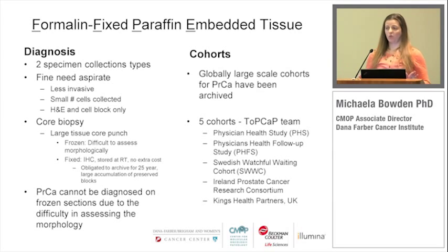making that the gold standard. So the gold standard's fixed tissue, which, as we talk about, has its limitations. Prostate cancer can't be diagnosed on frozen sections, but if you have the frozen material, it's obviously in better condition, so you can do more with it.